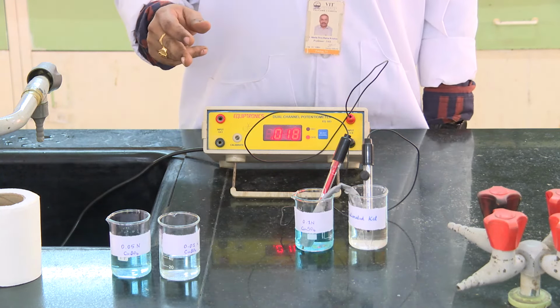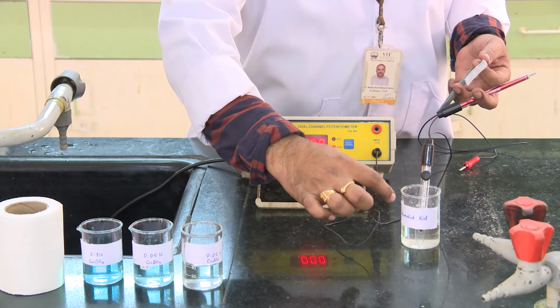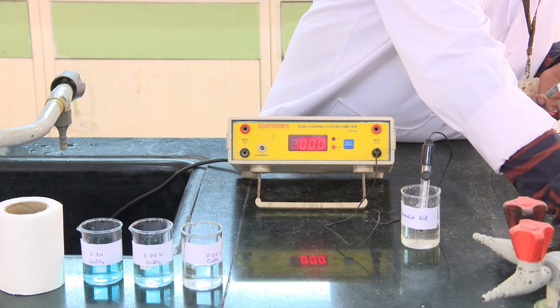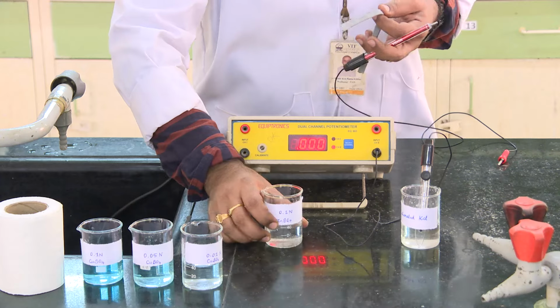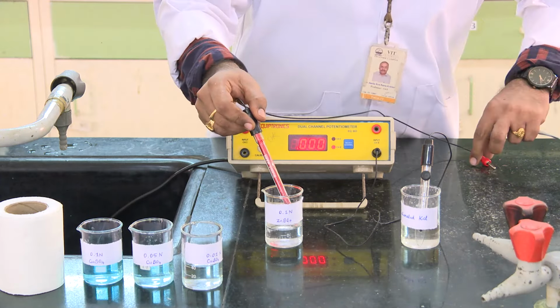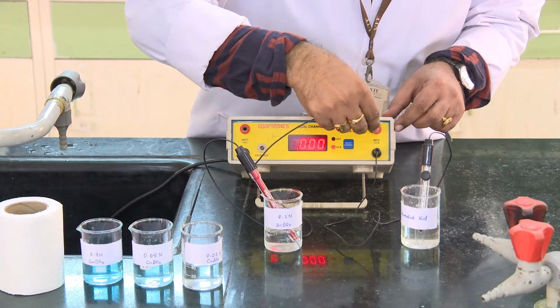Now we are going to move to the zinc system, where you can see the calomel electrode dipped in the saturated potassium chloride solution is connected to the potentiometer. I am going to take one of the concentrations of zinc, that is 0.1 normal, dip the zinc electrode here in the 0.1 normal solution, and connect it to the potentiometer.